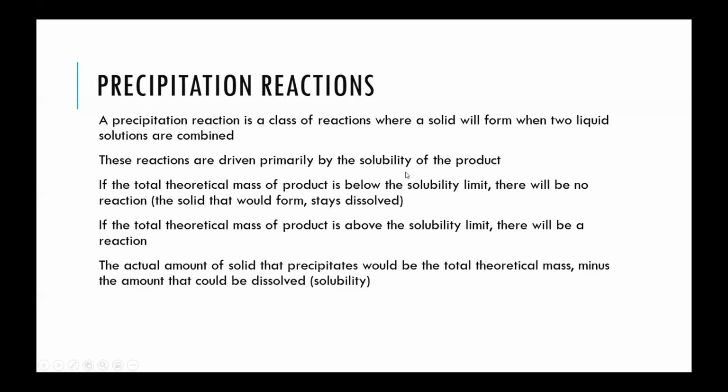Now this product or this solid is primarily formed from the solubility number. So thinking back to the solubility table, that value on a solubility table is the limit.